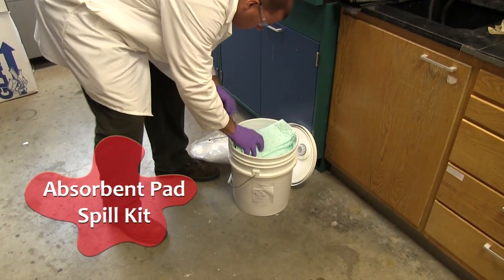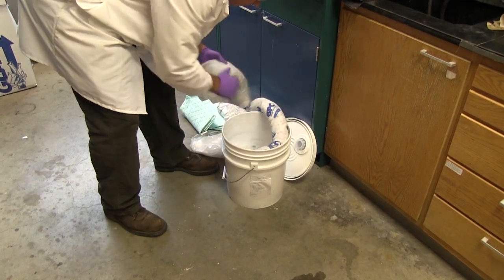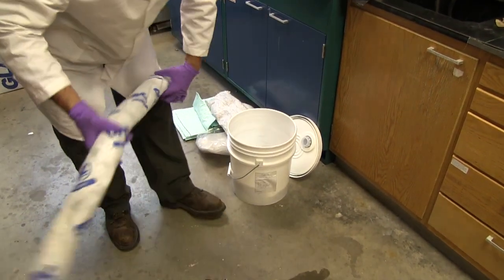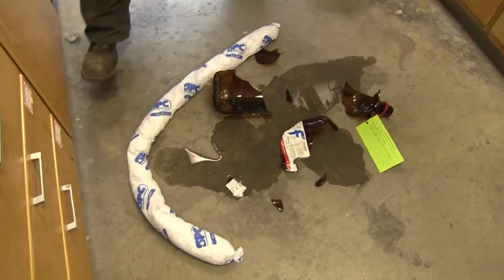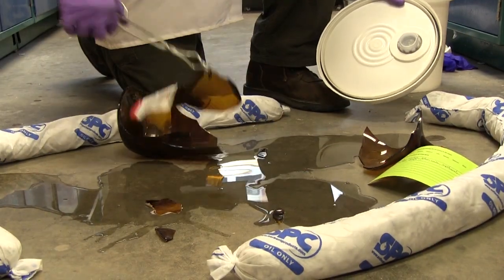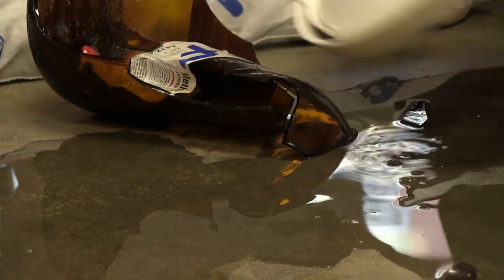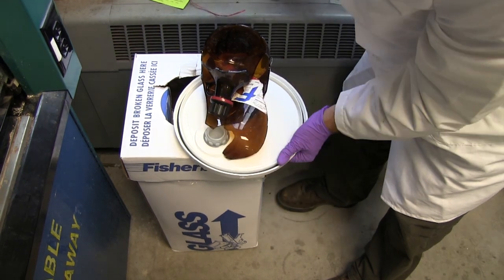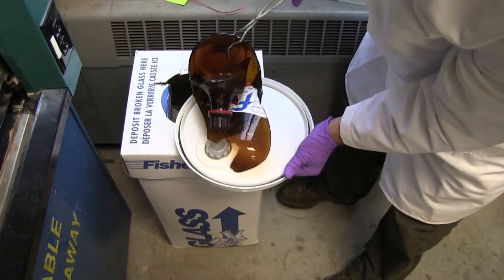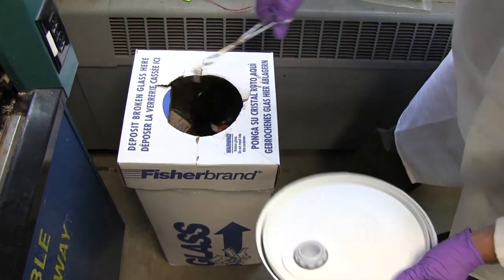Now we'll show you how to clean up a spill using an absorbent pad spill kit. Place a spill sock around the spilled material. Use tongs to remove broken glass from the liquid. If dry, remove the green waste tag from the broken bottle to keep for later use. Place any broken glass into the laboratory glass collection container.